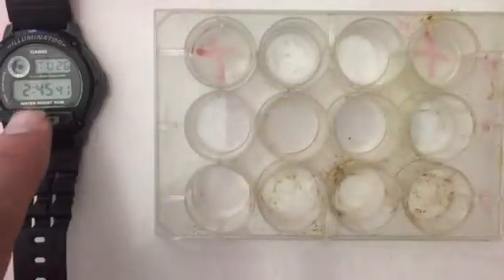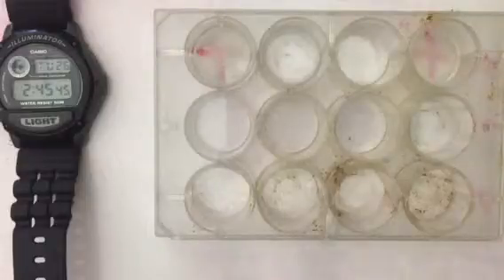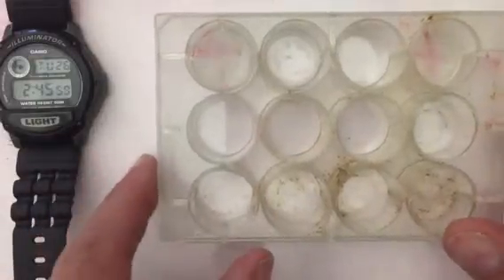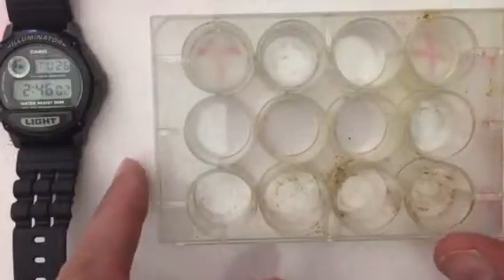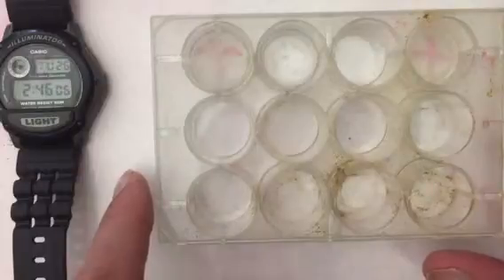And we have a time here as well. And this will tell us when the reaction essentially goes to completion. And our goal is to try and get some data and figure out which is going to react faster, which is going to react slower. And you can see now, it looks like the one on the left probably is a little bit faster than the one on the right.